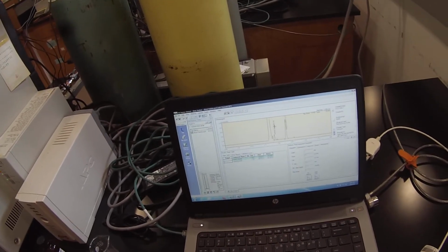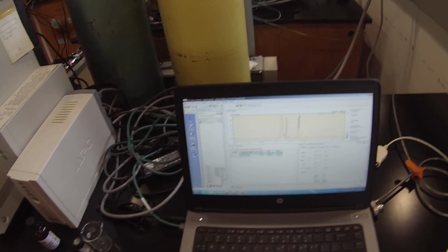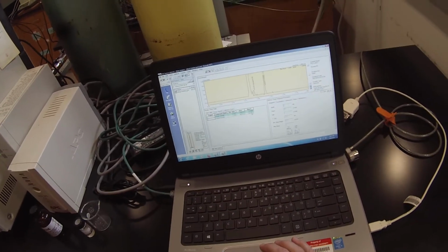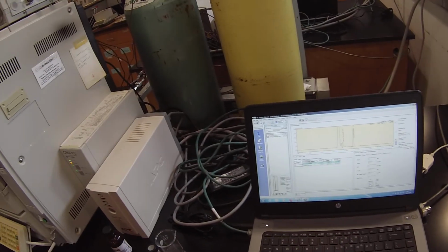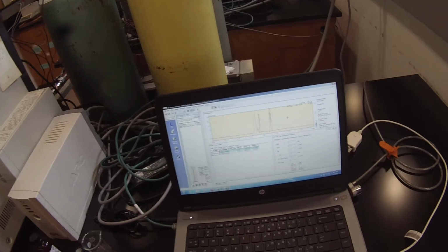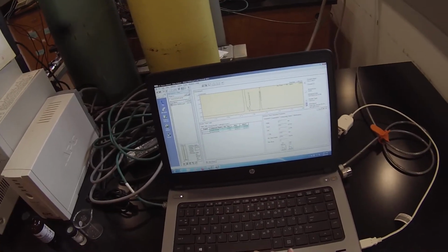So I'm just looking at my n-butyl chloride at 0.932 minutes and my n-butyl bromide at 1.153 minutes. And it looks like about a 19 to 81 area percent mixture. I'm going to save that data file with the correct integrations in there. I could, in fact, if I wanted to, go to the Edit menu and go to this compound.